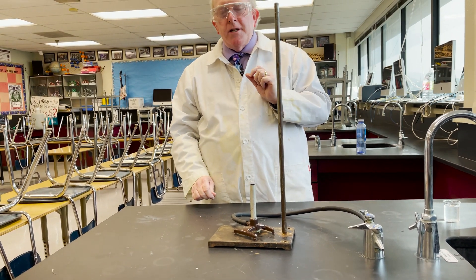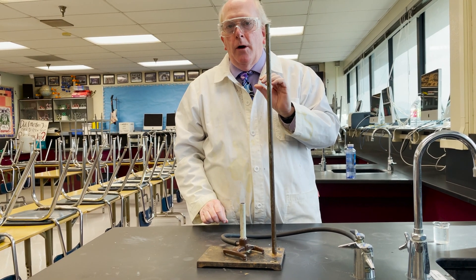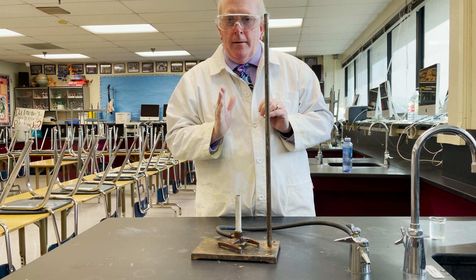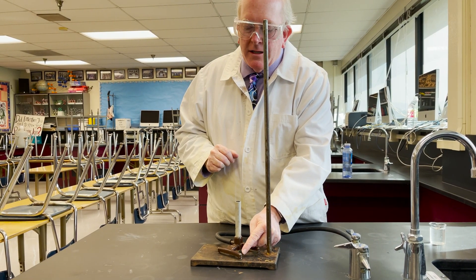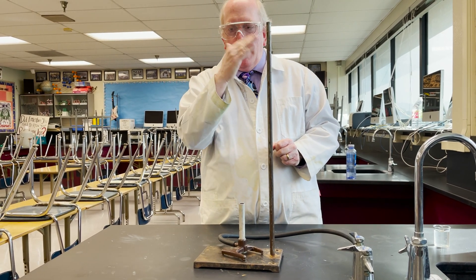As strange as this might seem, with the Bunsen burner you can hear what a good flame is. If you listen carefully, you're hearing a nice burning sound right there. When I close it off and deprive it of air, you lose that sound and it's just flopping around a lot.